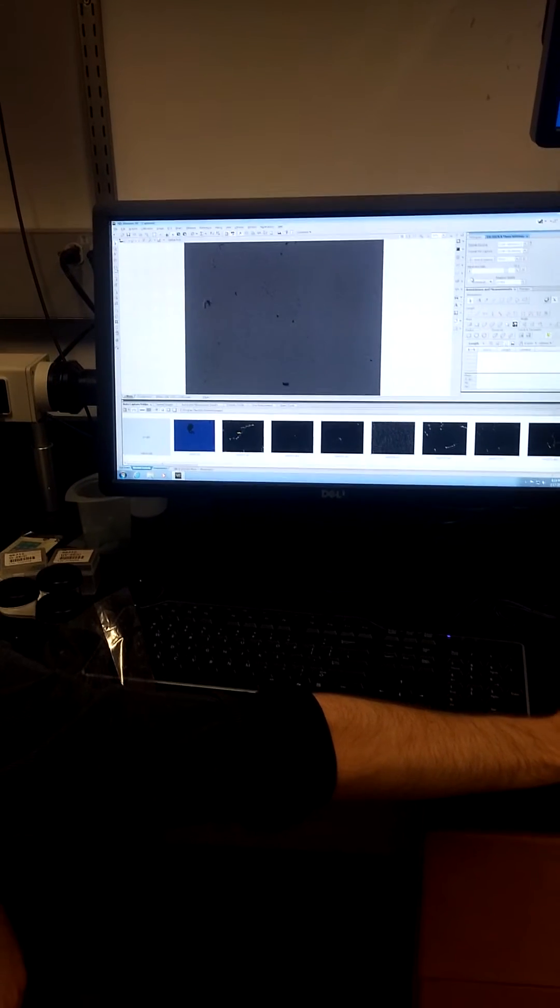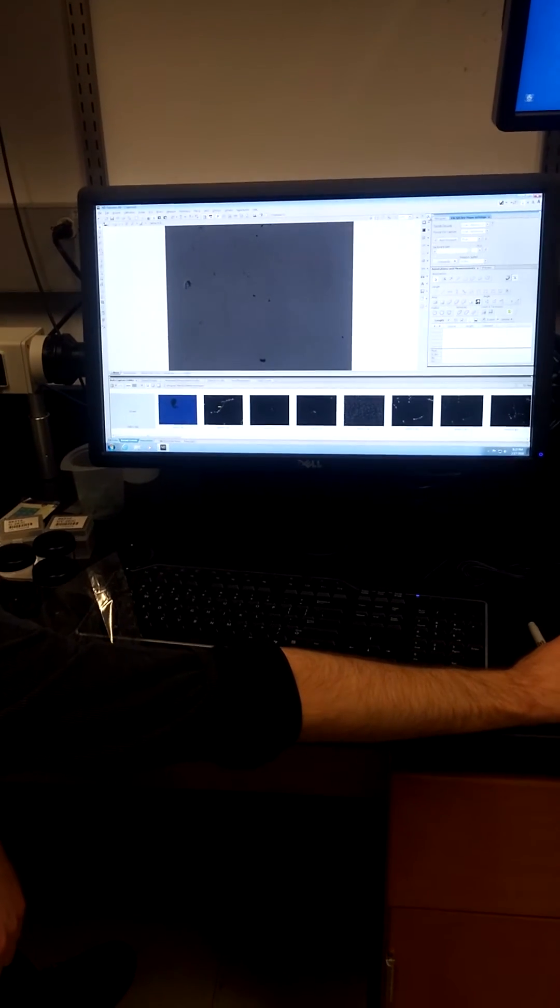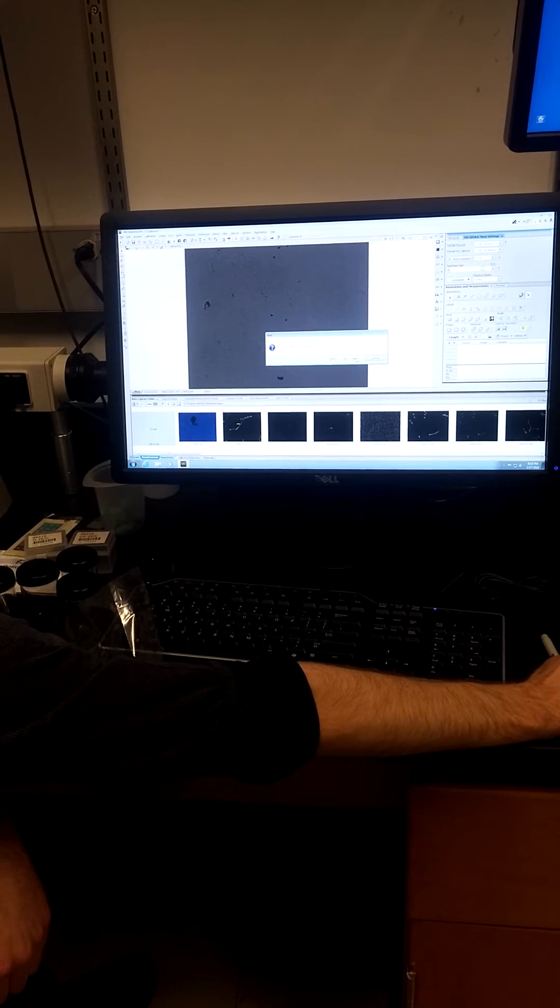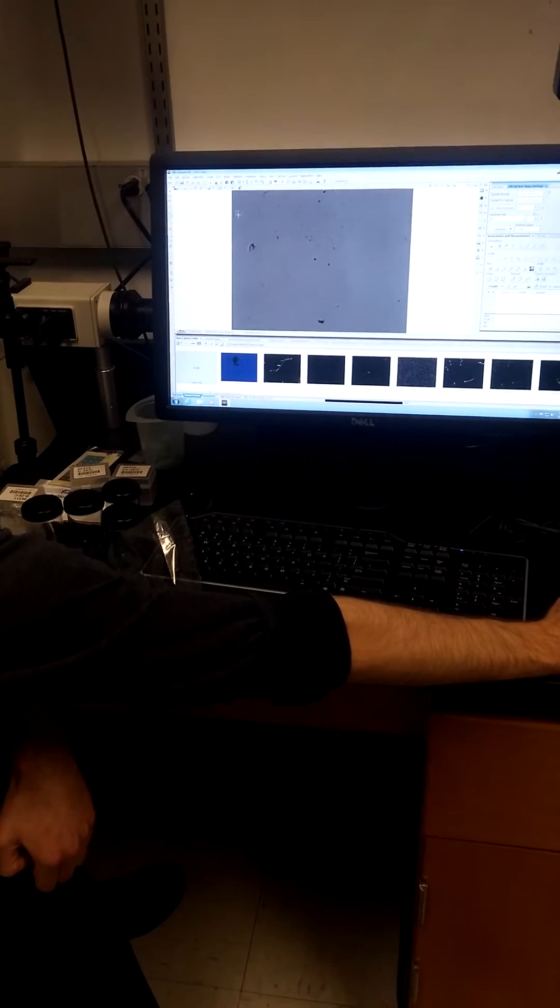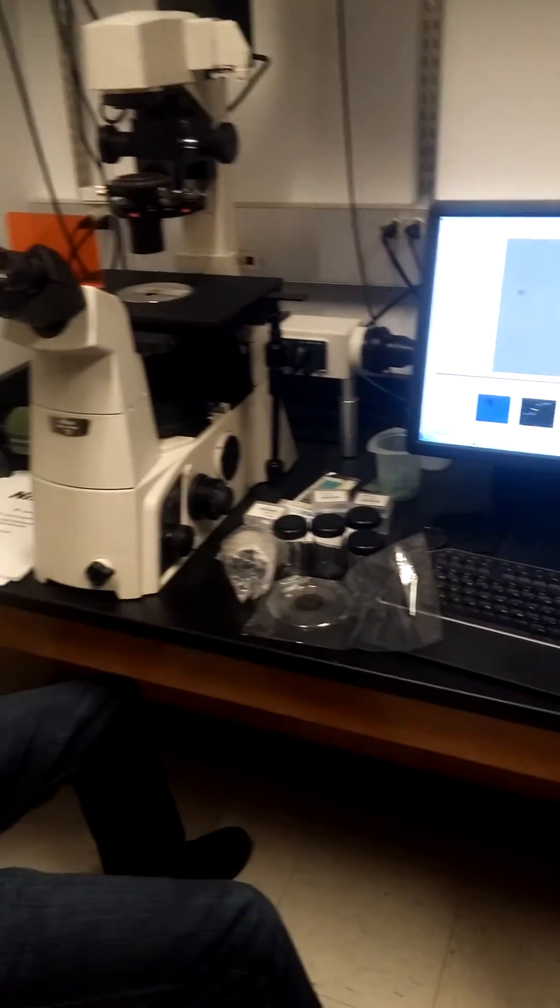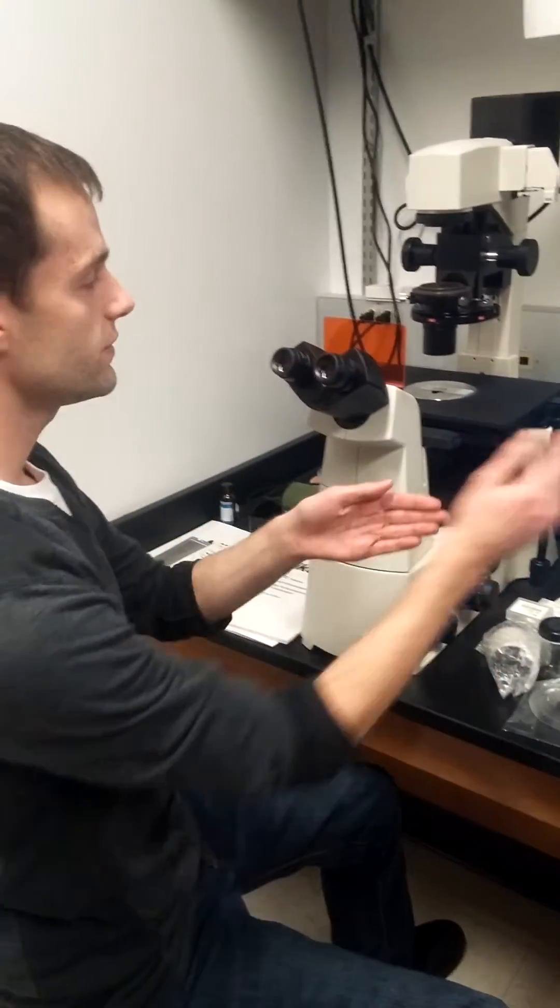So let's get out of that and close that by hitting the X in the right-hand corner. And now we're going to go back to the live feed. So now we've taken a bright field image.